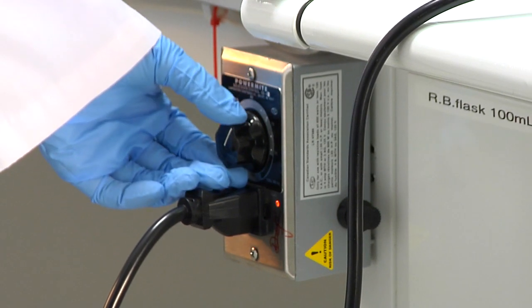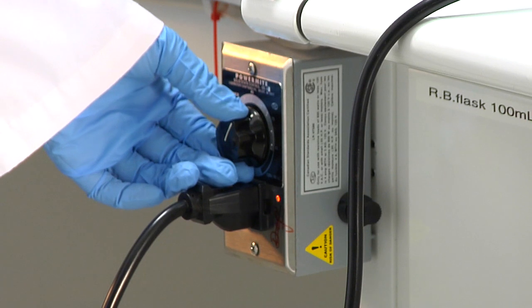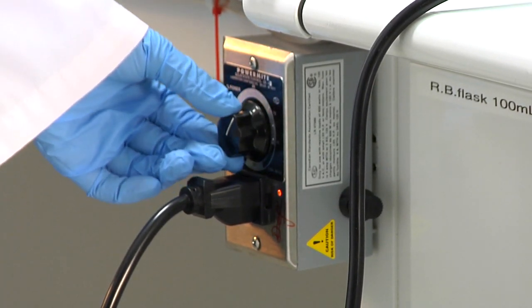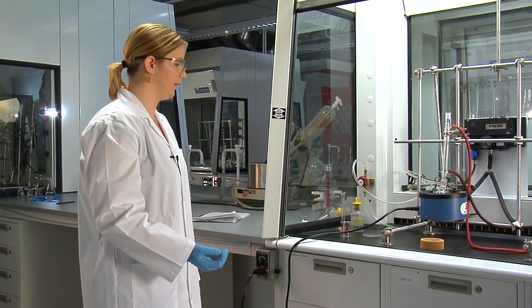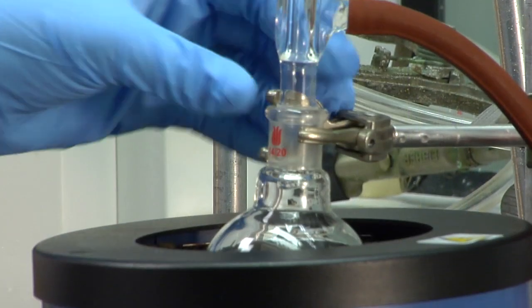Okay, so we're setting the variac probably at about 50 is good to get it started. And then depending on how fast it's boiling, you can adjust from there. You might have to turn it down a bit. But that's a good starting point to get it going. So just keep an eye on it and adjust from there.